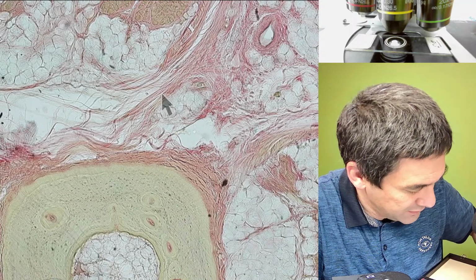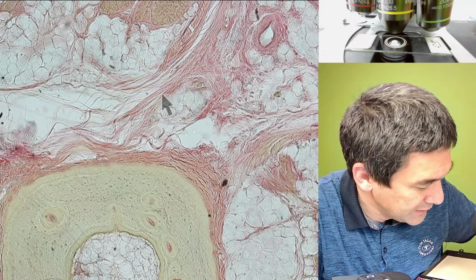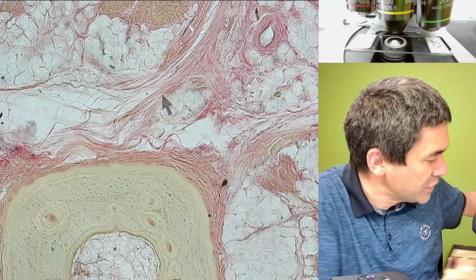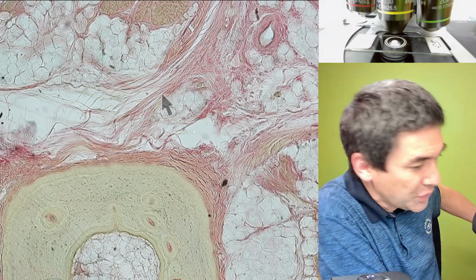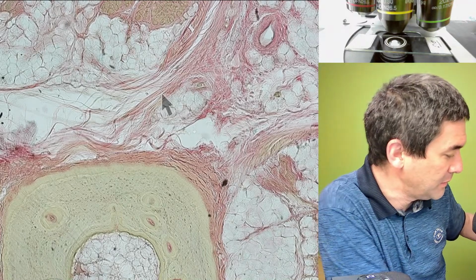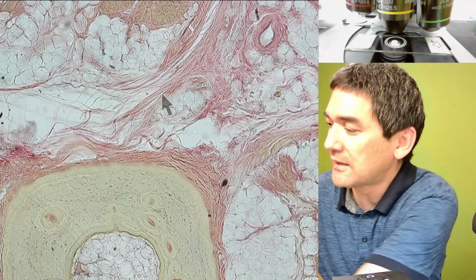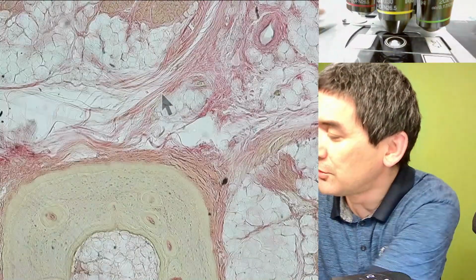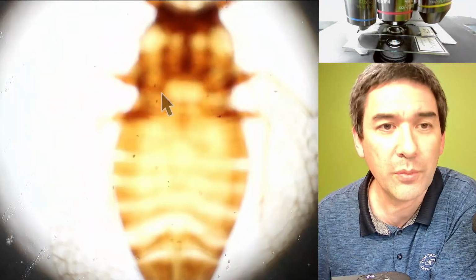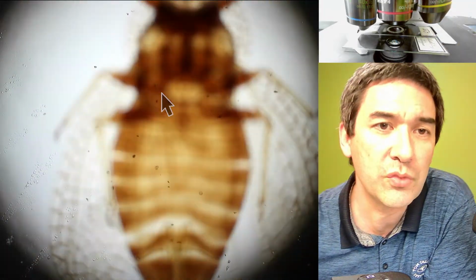So that's a plant. I just want to show you, cross sections do exist. Also whole mounts do exist. Got to be careful, that's another antique slide. Again, please do check my videos. I did make, how do you say, several videos where I show this, just to illustrate it.